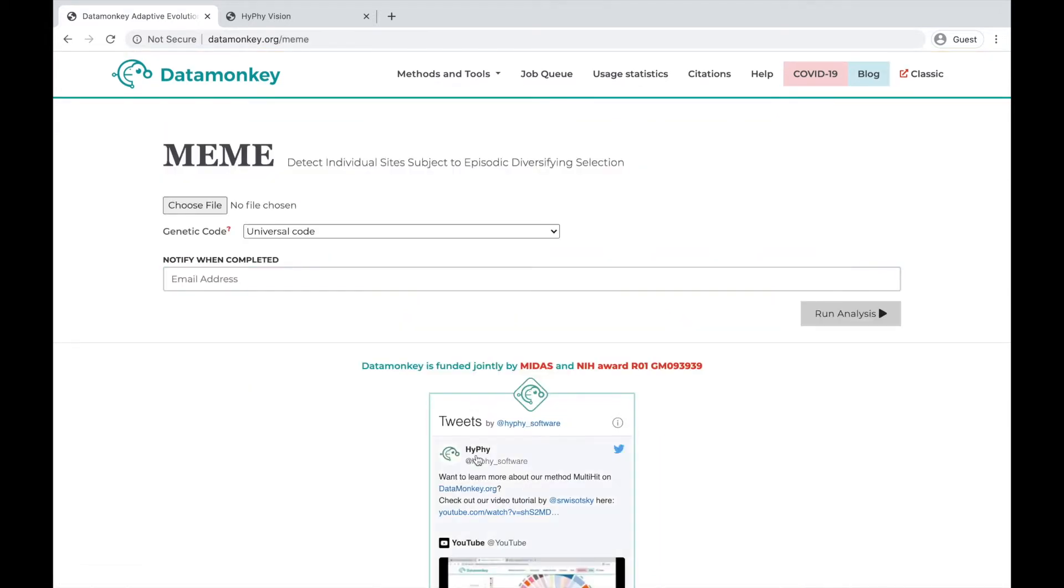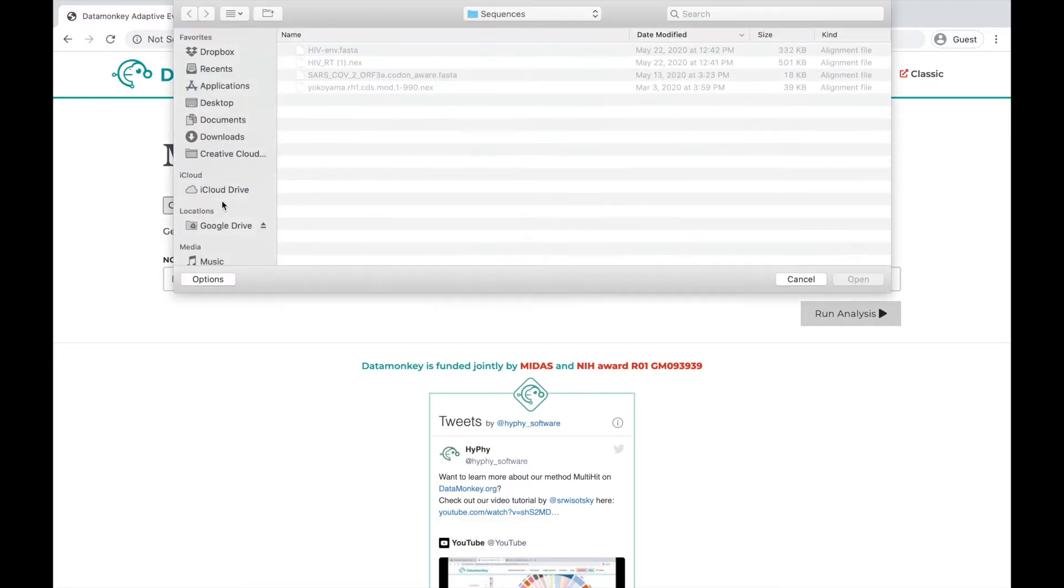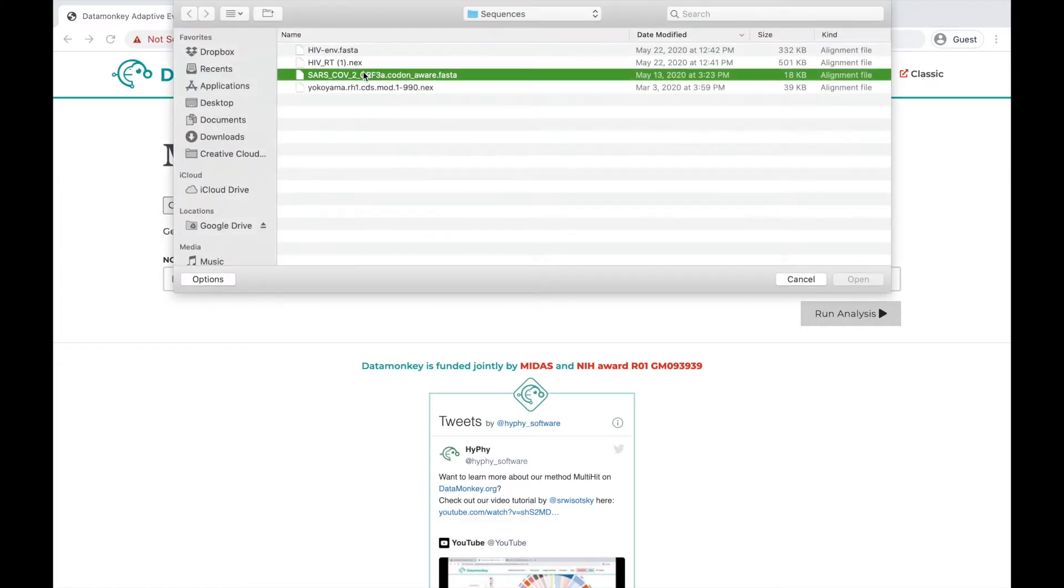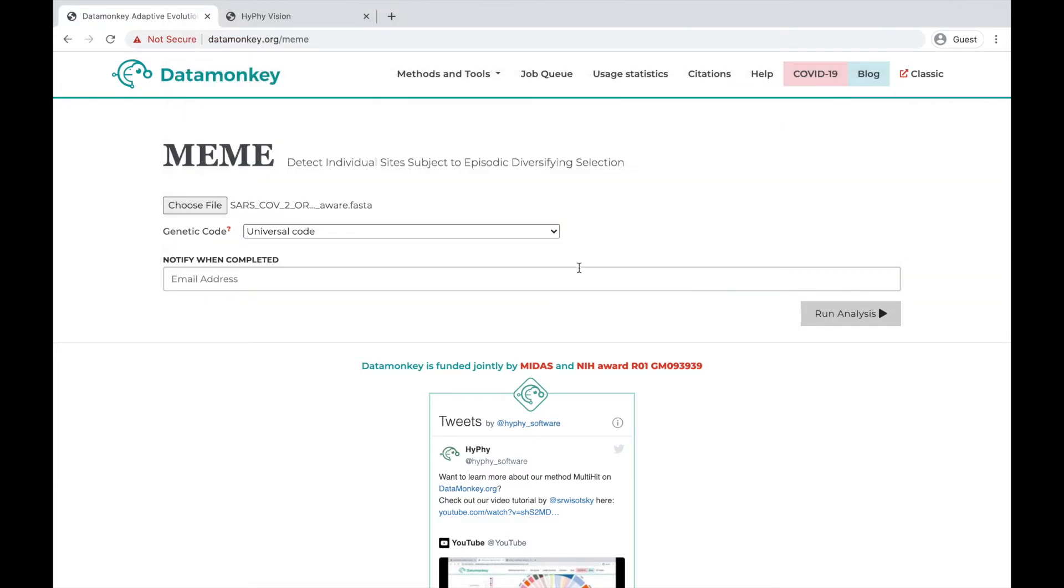Once you've selected a method, you'll be prompted to choose your alignment file, the type of genetic code it uses, and enter your email to be notified when the analysis is completed. So we'll go ahead and do that.